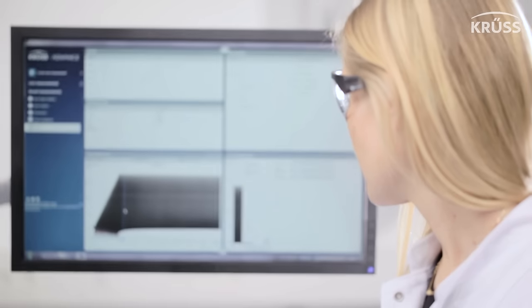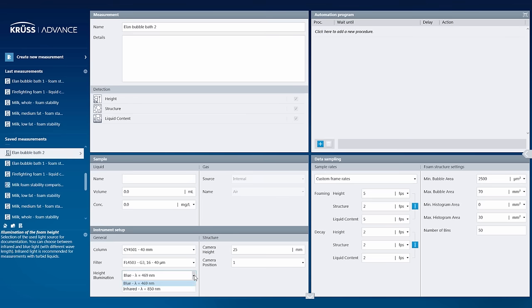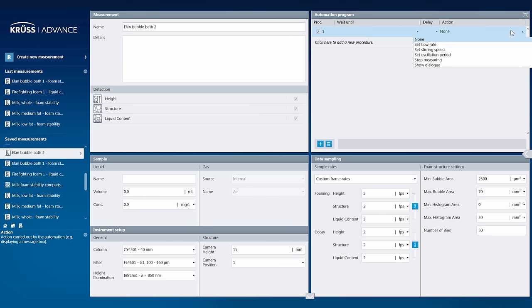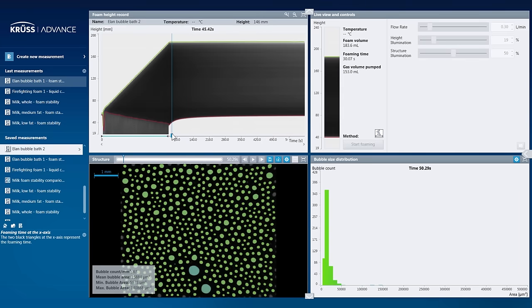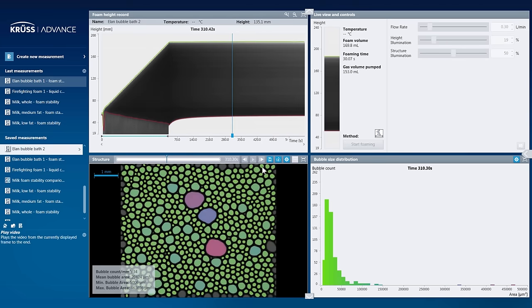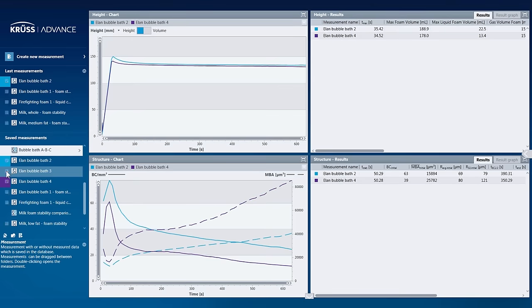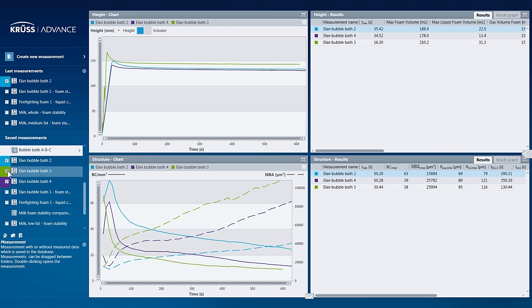Our intuitive software, ADVANCE, controls the DFA 100. With ADVANCE, all of the measurement parameters are customizable and every measurement can be fully automated. It is easy to use, allows live observation, and provides numerous reports. Results can be compared between different measurements and exported in many different ways.